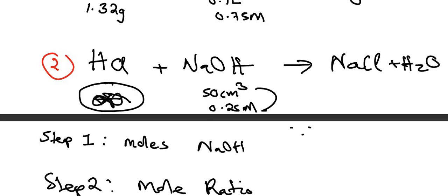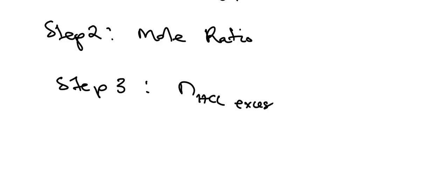And this number of moles you get from step 2, you're going to call the number of moles of HCl that were in excess, the ones that we took in the second equation to react with your sodium hydroxide for the neutralization. So you keep them. These are the excess. Then you go to step 4.